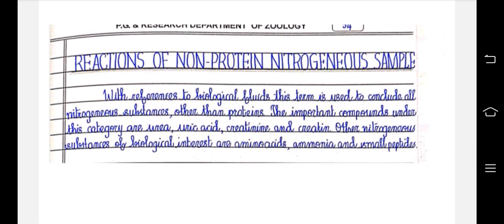Reactions of non-protein nitrogenous substances. With reference to biological fluids, this term is used to include all nitrogenous substances other than proteins. The important compounds under this category are urea, uric acid, creatinine, and creatine. Other nitrogenous substances of biological interest are amino acids, ammonia, and small peptides.